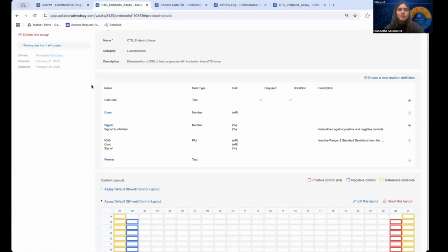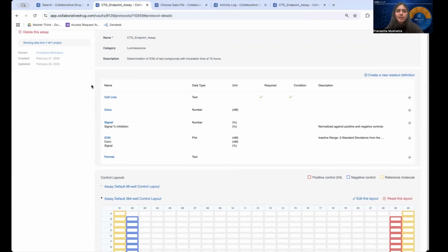So protocols are just containers for your assay data. It not only stores your data, but performs calculations over it. Once you create a protocol and its framework, you don't need to redo it every time there is new data. Instead, you can upload a new run or experiment to the existing assay and apply the same framework over all data uploads.